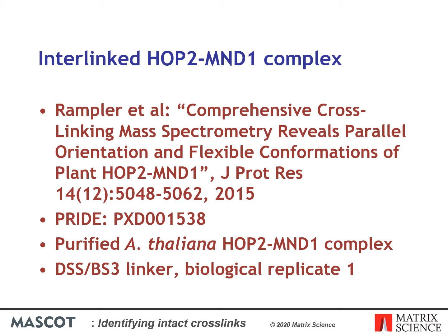DSS has 2 identical reactive groups, so it's homobifunctional. It's amine reactive and creates intact crosslinks between lysines and protein N-term. The study was designed so that there are only lysine-lysine links.